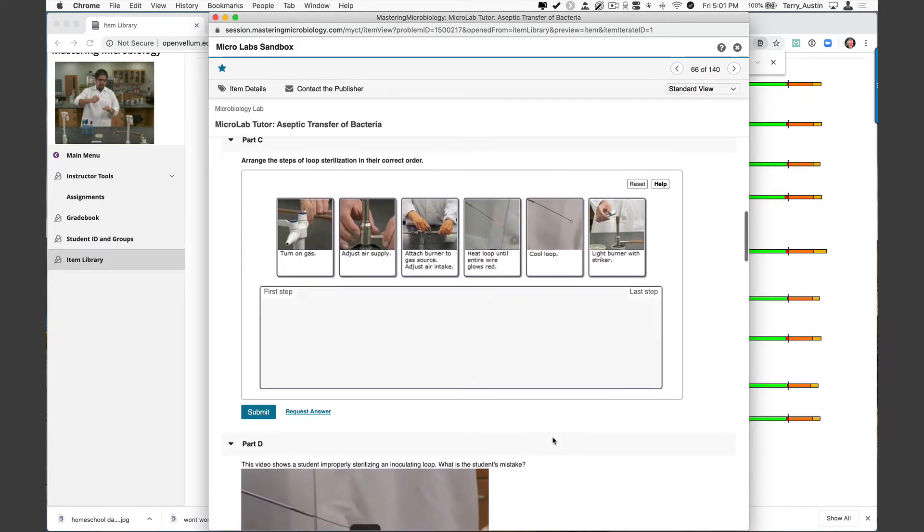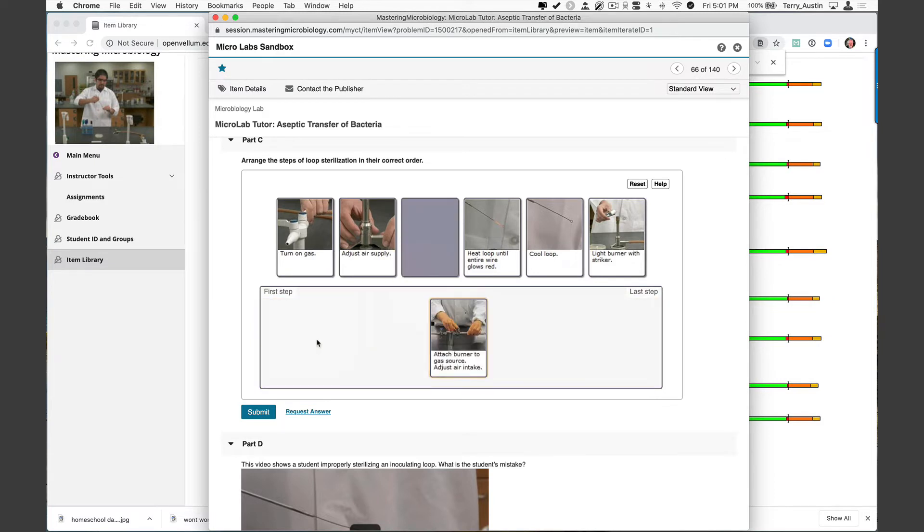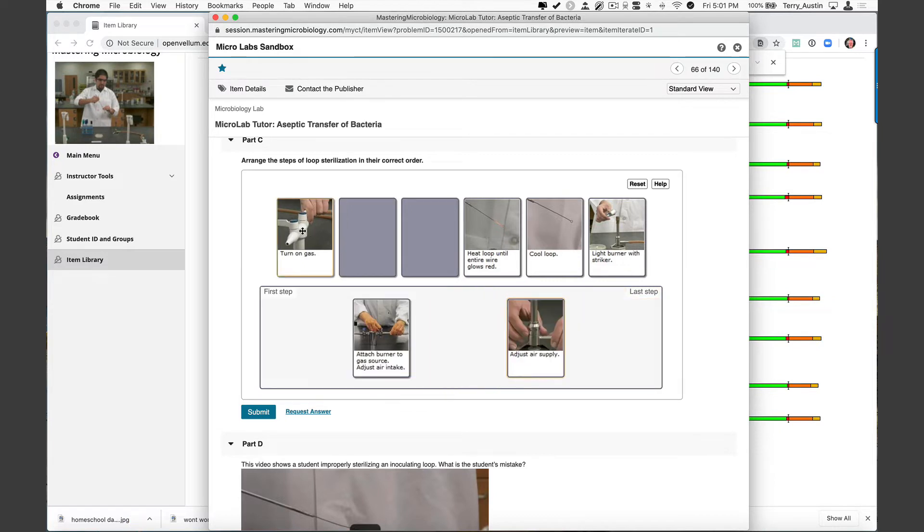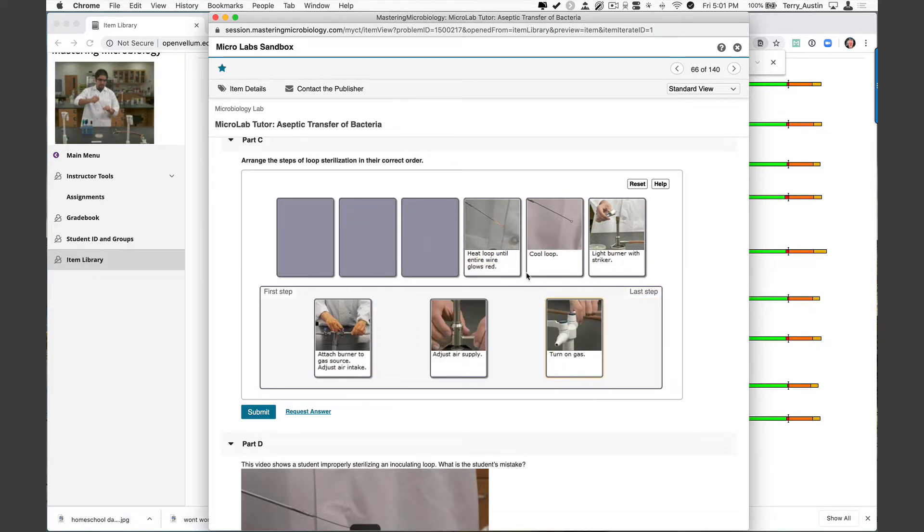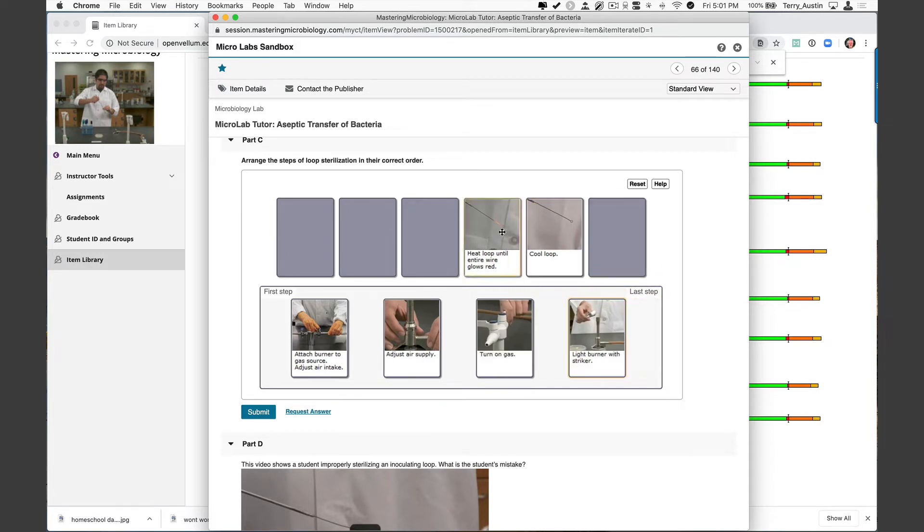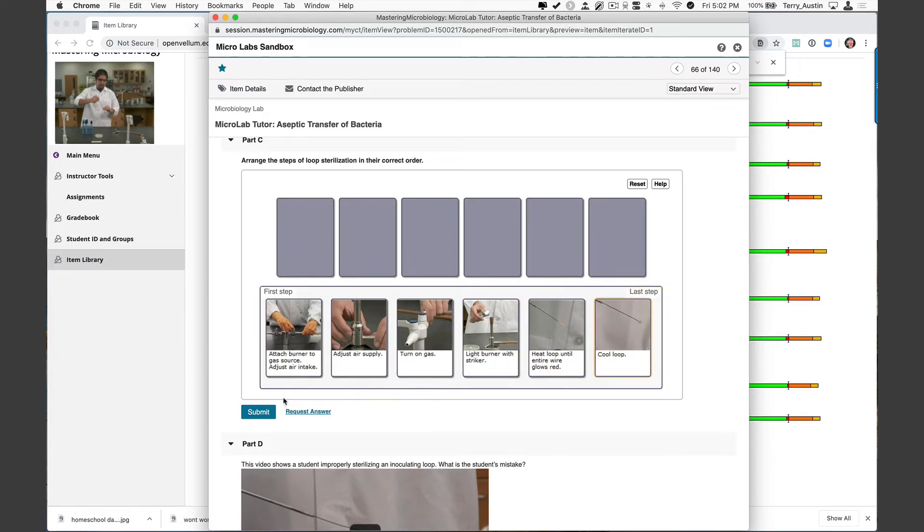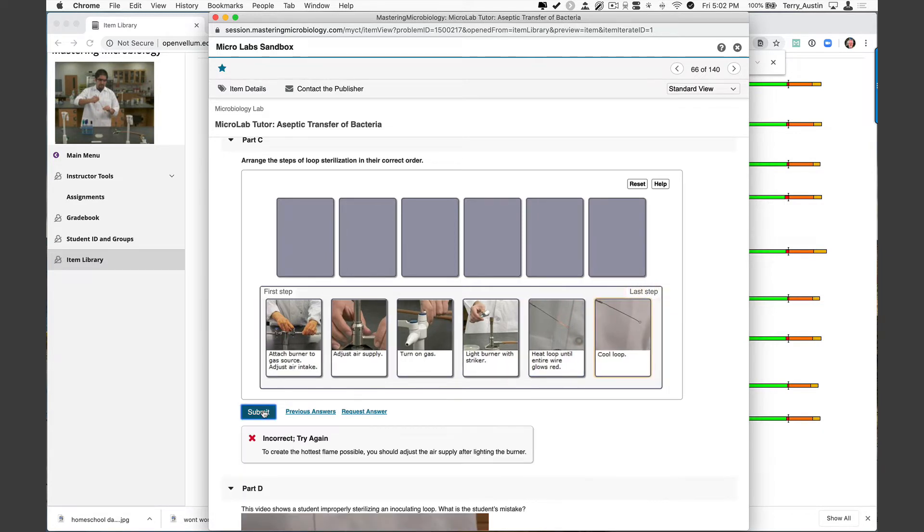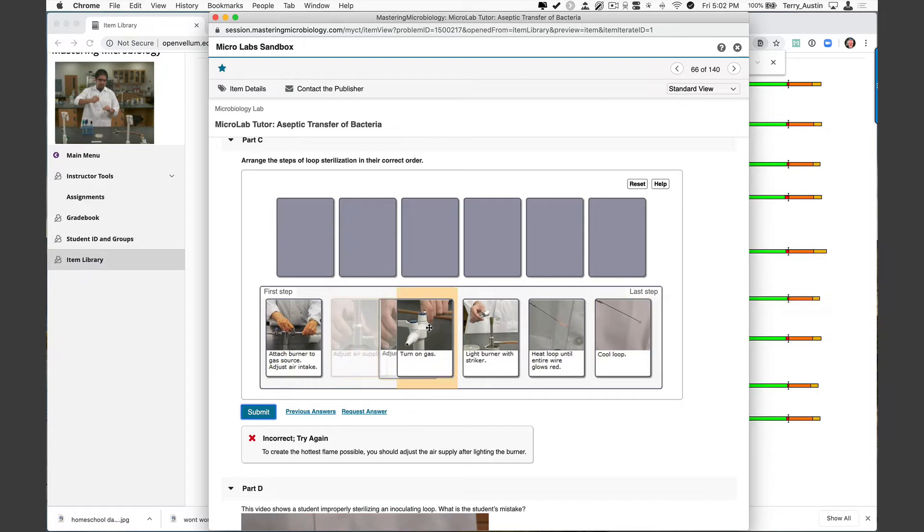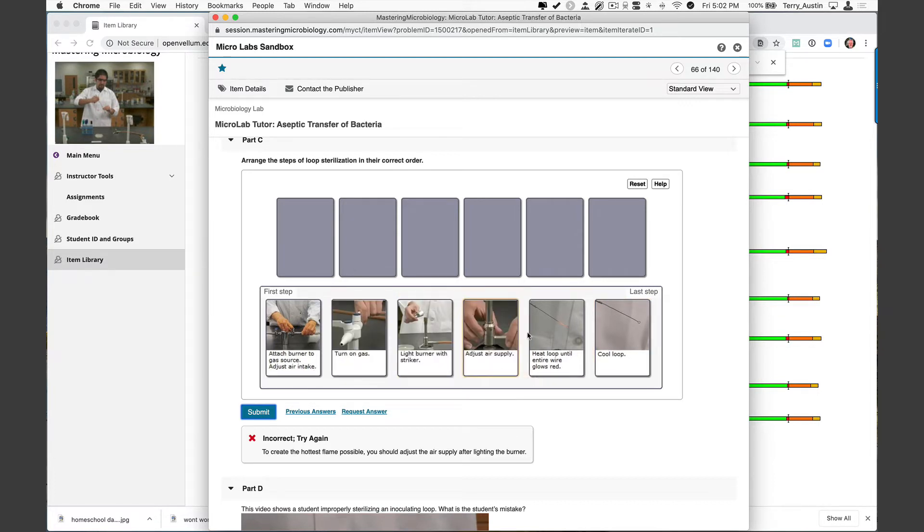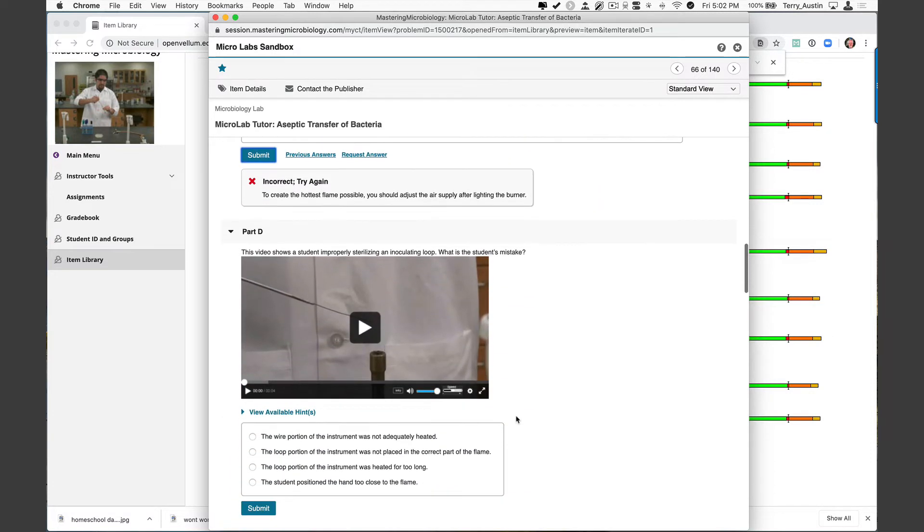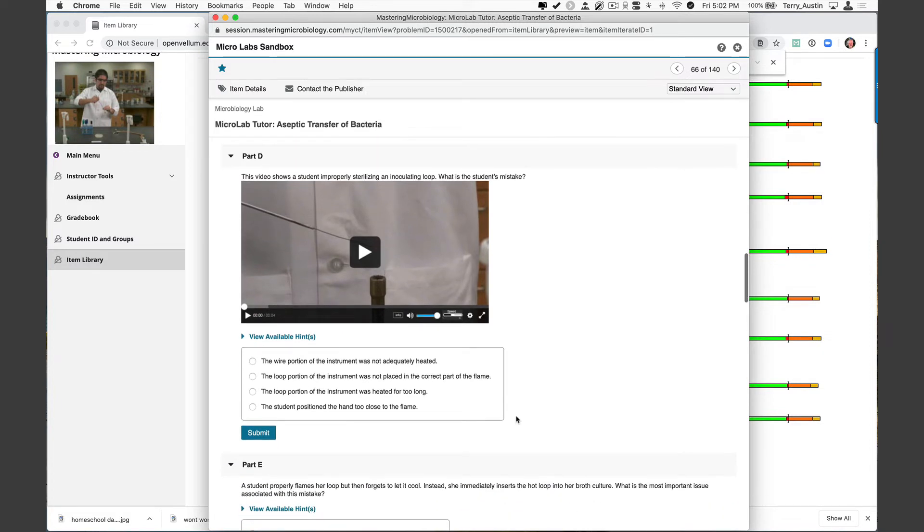This part C, for instance, has students arranging the steps. So we probably first want to attach the burner and then possibly adjust an air supply. Maybe do a little bit of turning on the gas, lighting the burner, heating the loop, cooling the loop. And then submit that and see if we're good. And I actually had an issue that was there. We might want to adjust the air supply after lighting the burner. So we'll rearrange those two. And you can see that your students are actually getting some good feedback when they make some errors. This one I really do love. And I love thinking back to my own times in the micro lab, especially early in the semester where you have to just really watch student techniques and make sure they're good.